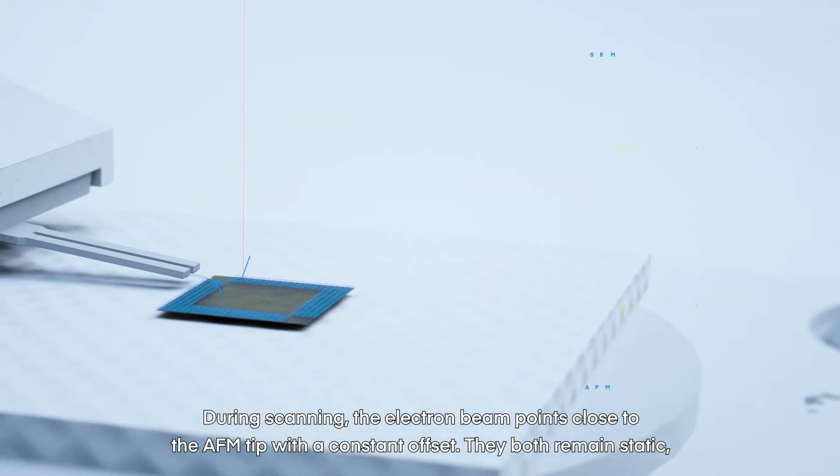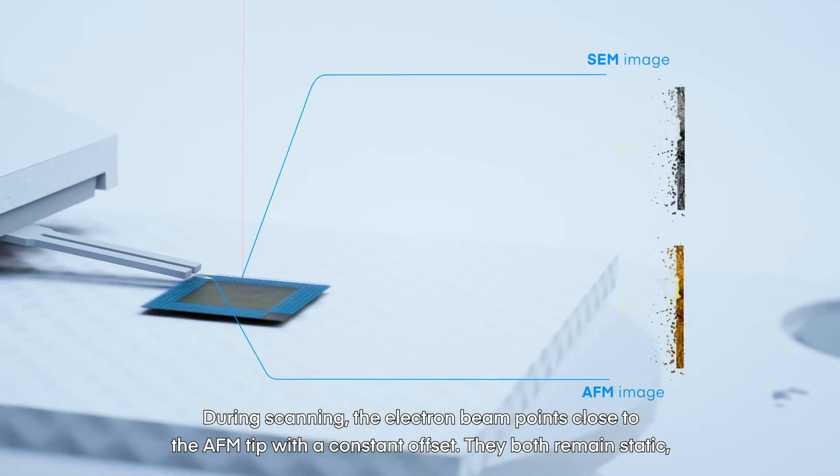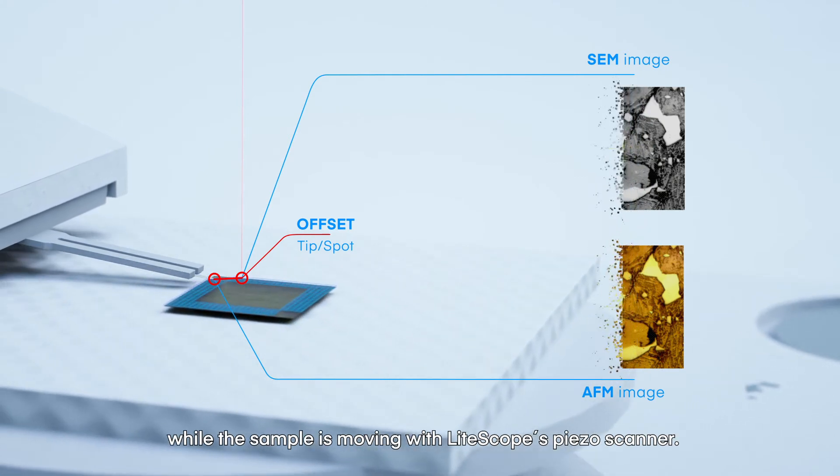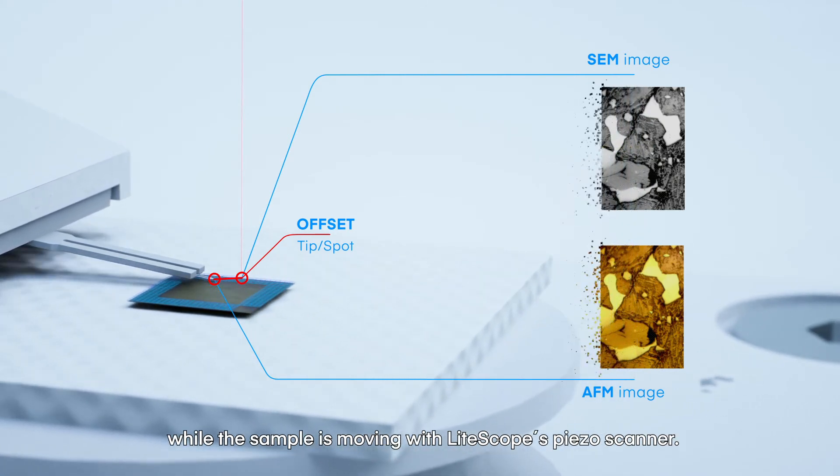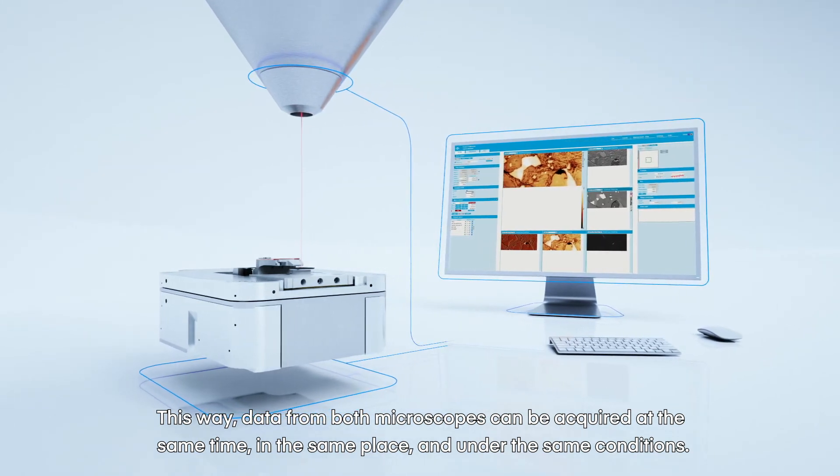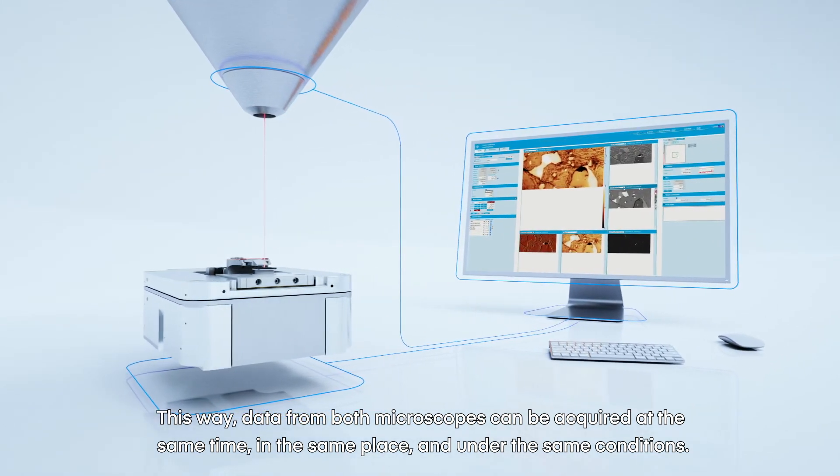During scanning, the electron beam points close to the AFM tip with a constant offset. They both remain static while the sample is moving with LiteScope's piezo scanner. This way, data from both microscopes can be acquired at the same time, in the same place, and under the same conditions.